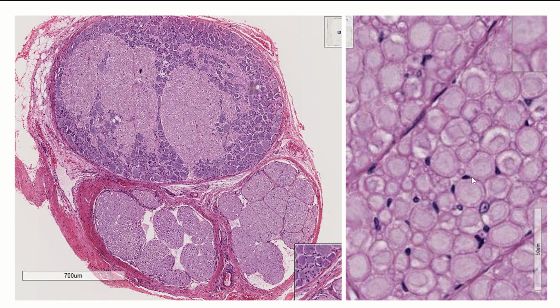Okay? And here you can see some Schwann cells. They're like little hats. So some of these are fibroblasts within here. Like this one's probably a fibroblast with the really flat nuclei. But when they look like they're little hats on the myelin sheath, they're probably Schwann cells. And it is hard to tell the difference.